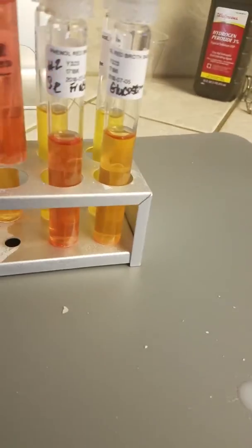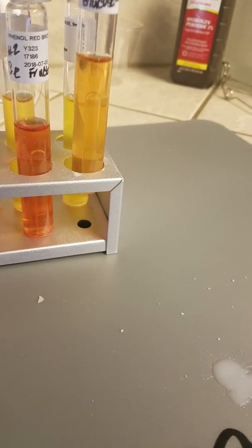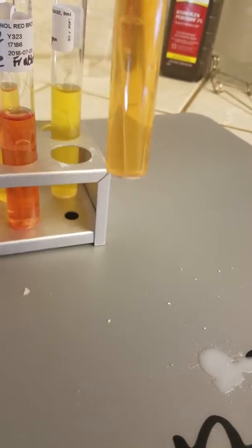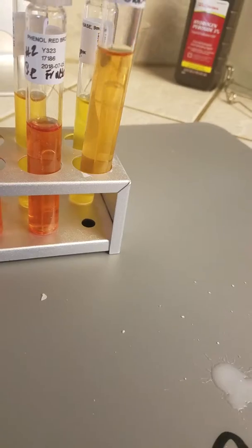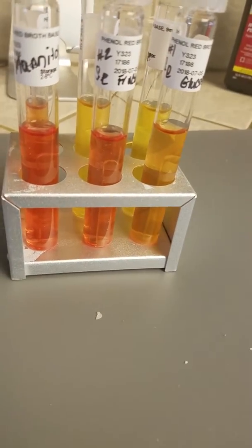Now my only concern is that I believe it was the glucose. I don't think the glucose got as much in the staph as it did the yeast. So I'll have to look that up to see if that affected my results.